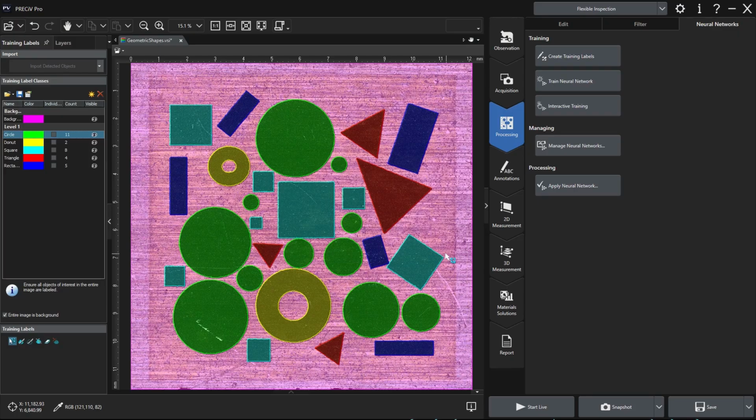This sample here was chosen to demonstrate labeling, and the only way to introduce at least a little bit of sample variation is by acquiring it with different contrast techniques, focus conditions, or exposure times. This is what I did, but remember, for a real neural network training, this would not be enough.